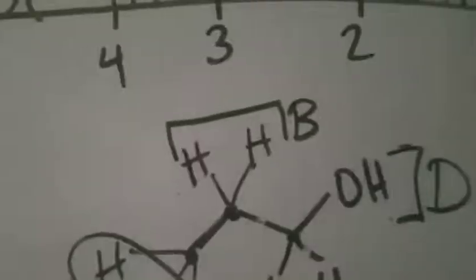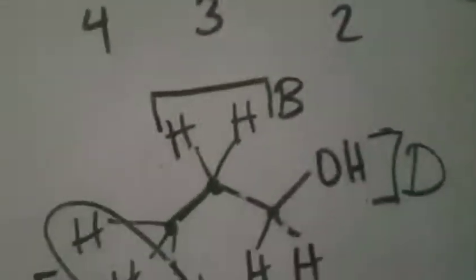So obviously this one has to be my CH2 group here. So I'm going to say this is B right there. So that corresponds. So that lets me know when I'm grading it, you think this is A, this is B, and then we're going to do C and D next, okay?